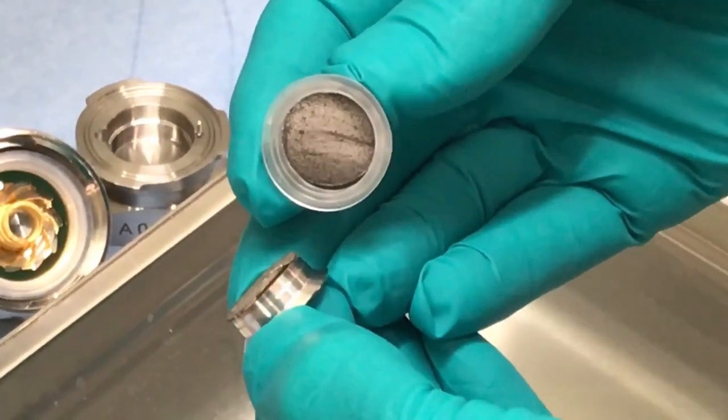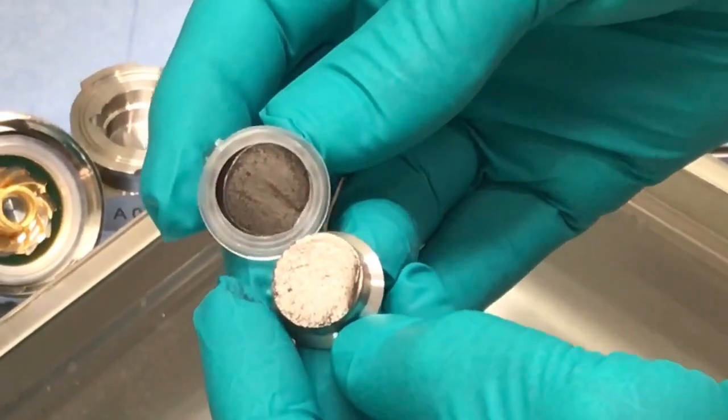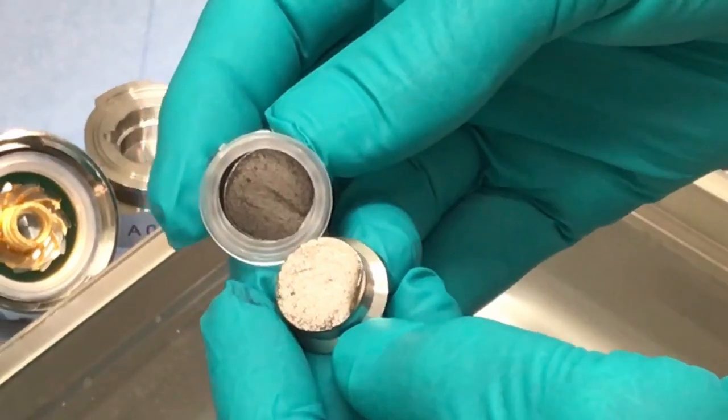You see the grayish color of the lithium metal, especially on the separator which is in part remaining inside the sleeve.